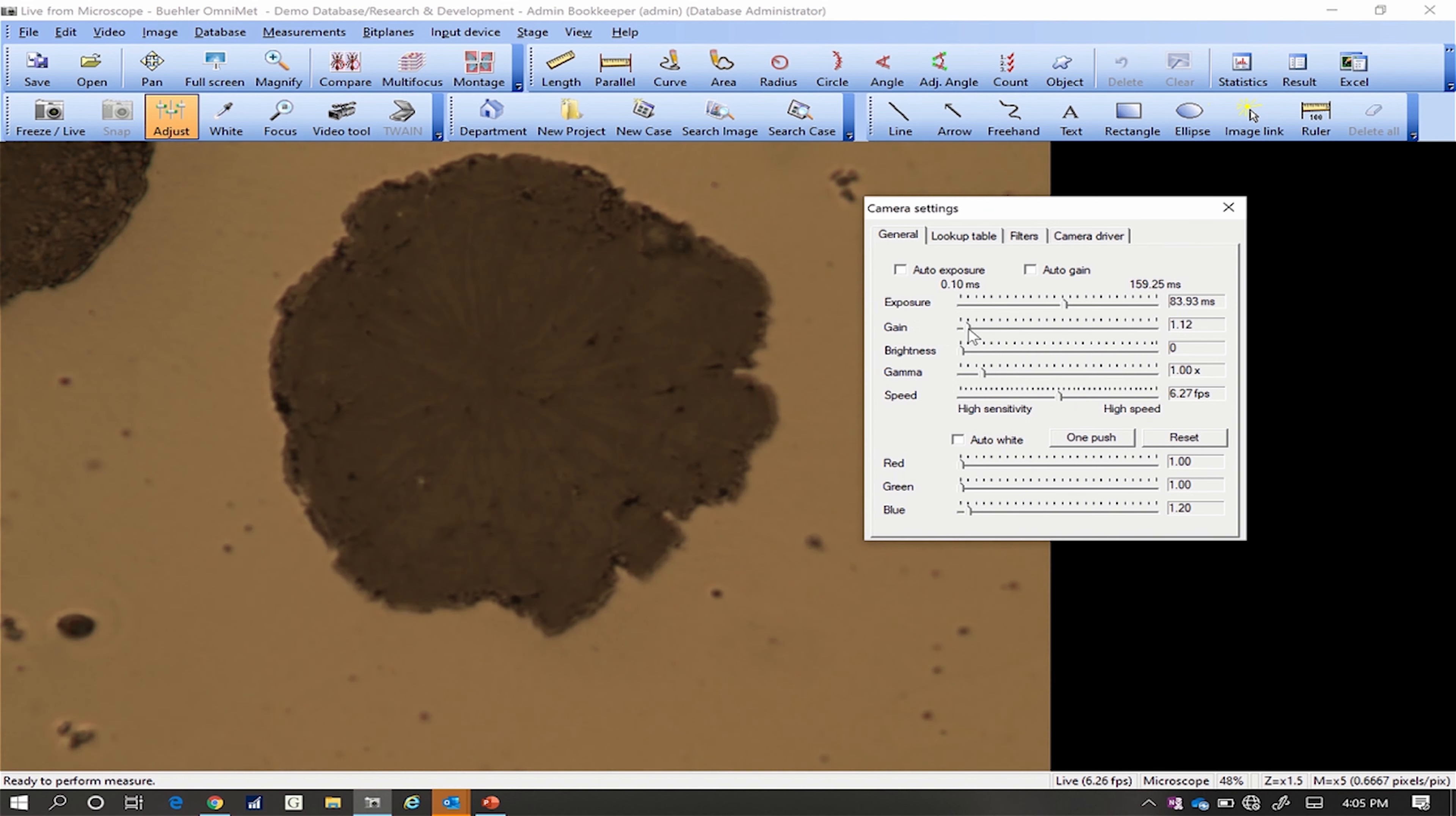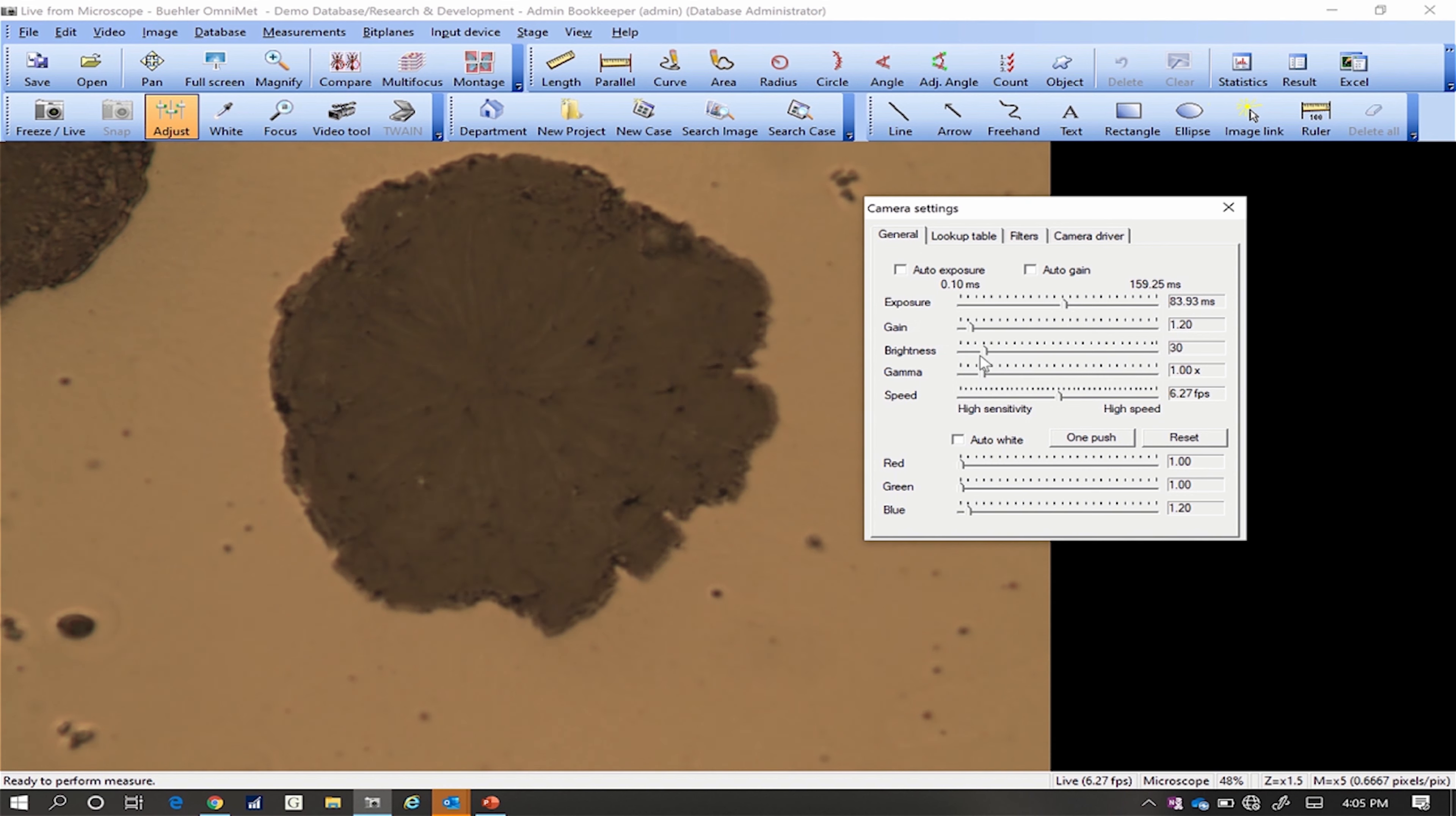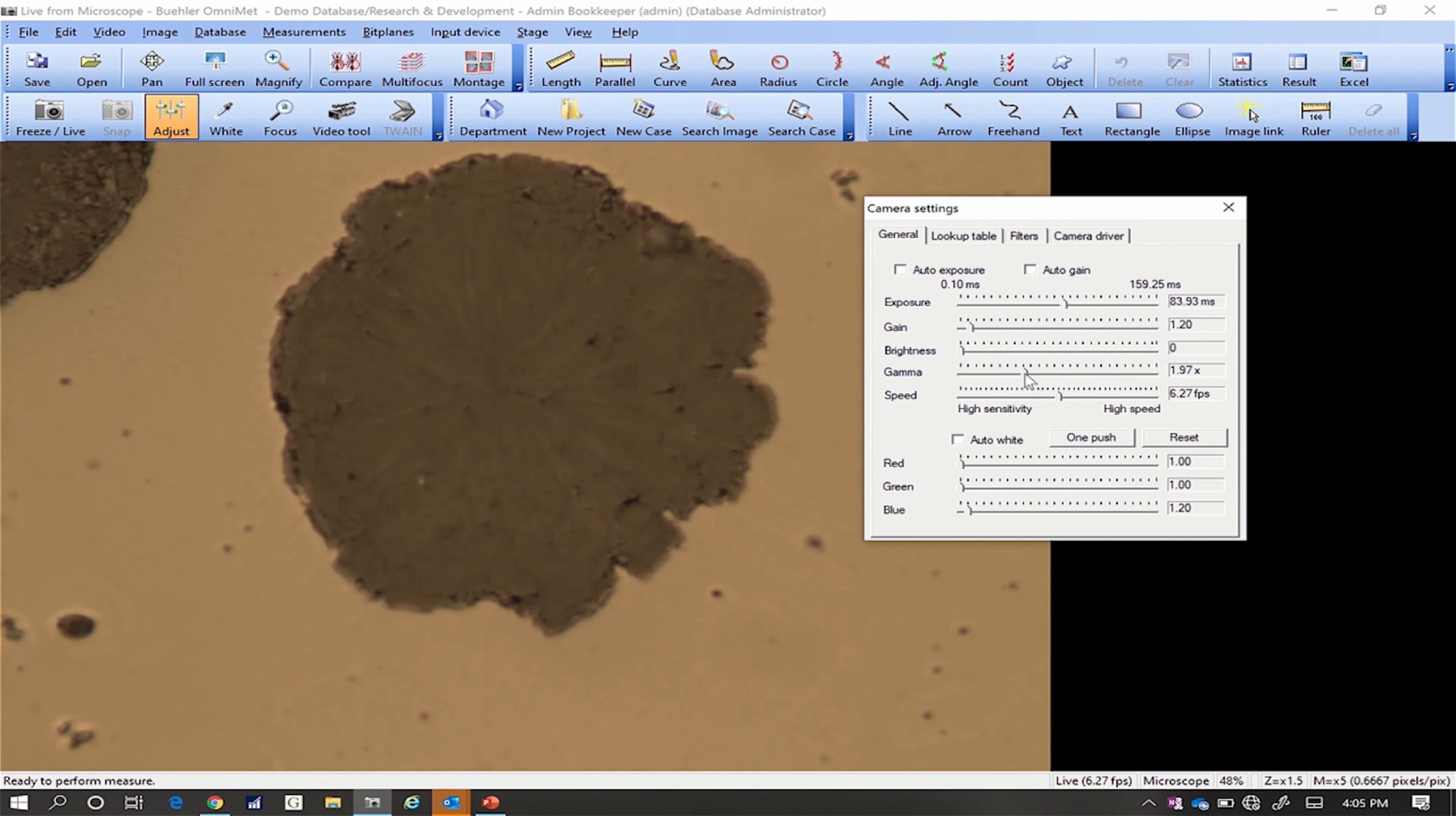This depends on the camera being used, but the apparent image should have a similar brightness to the view through the eyepiece. Leave brightness at its default. Set gamma between 2 and 2.15.